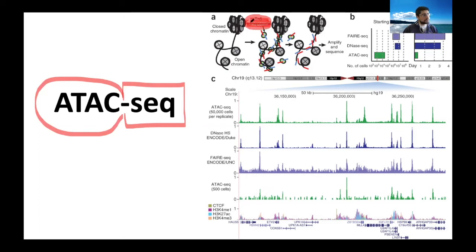The information that the addition of this enzyme on the chromatin is giving us is telling us: is this region open or closed? So is this accessible to transcription factors or not? Usually the open regions in the genome are considered to be active in the sense of transcription and regulation, while the closed regions are considered to be inactive or repressed, okay?